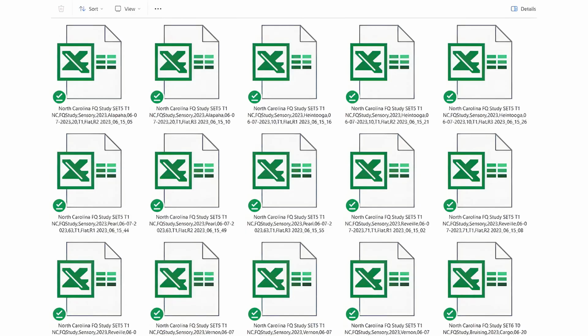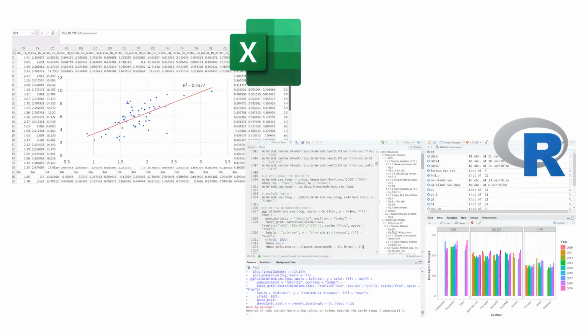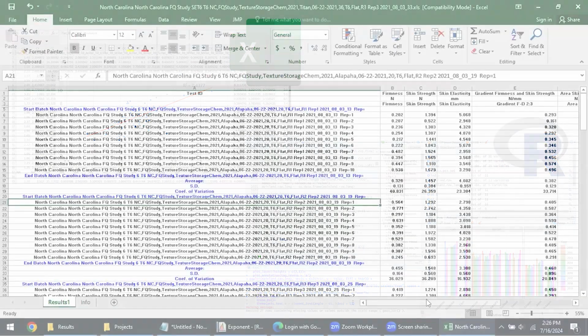To analyze the data from the texture analyzer, you need to use the output file. The output file is a simple Excel file with the parameters that you're interested in. You can change the type of parameters to be included in the resulting Excel sheet. For downstream analysis, you can just use the output Excel sheet like any other dataset you have. You can run analyses on Excel itself, or you can use other statistical softwares as well.